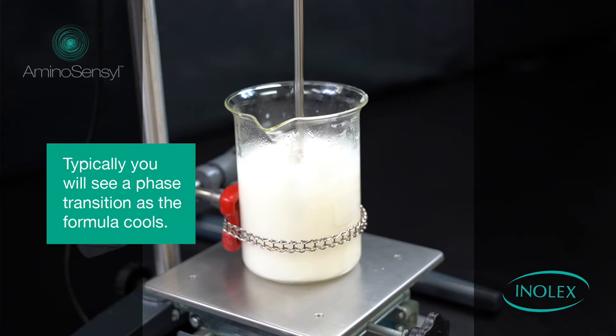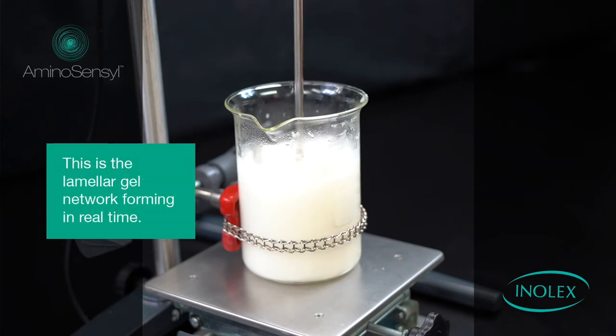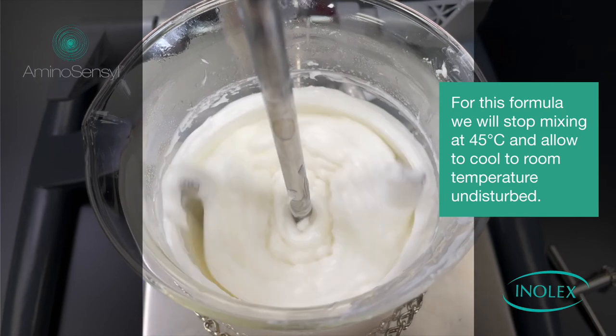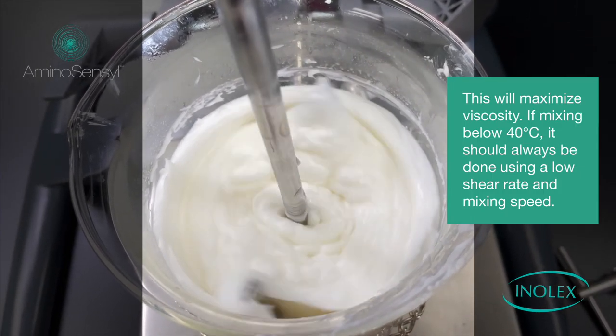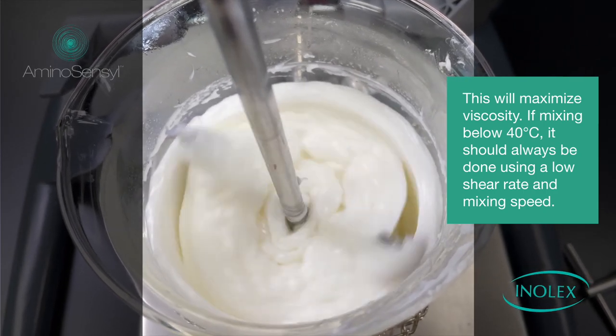Typically, you will see a phase transition as the formula cools. This is the lamellar gel network forming in real-time. For this formula, we will stop mixing at 45 degrees Celsius and allow it to cool to room temperature undisturbed. This will maximize the viscosity. If mixing below 40 degrees Celsius, a low shear rate and mixing speed is recommended.